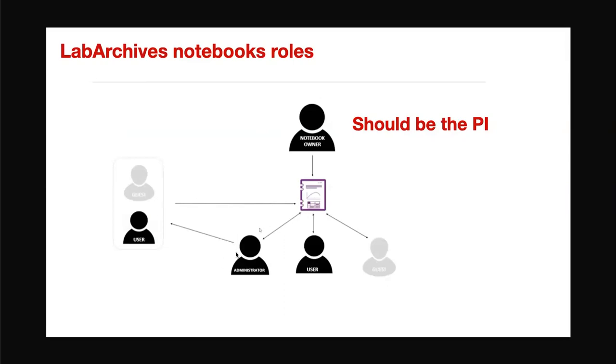You can have an administrator, possibly the lab manager, and then you can invite other people as guests. So if you collaborate with somebody else at Cornell or even outside of Cornell, you can give them access to your notebook. You can define what preferences, what privilege that this person has.